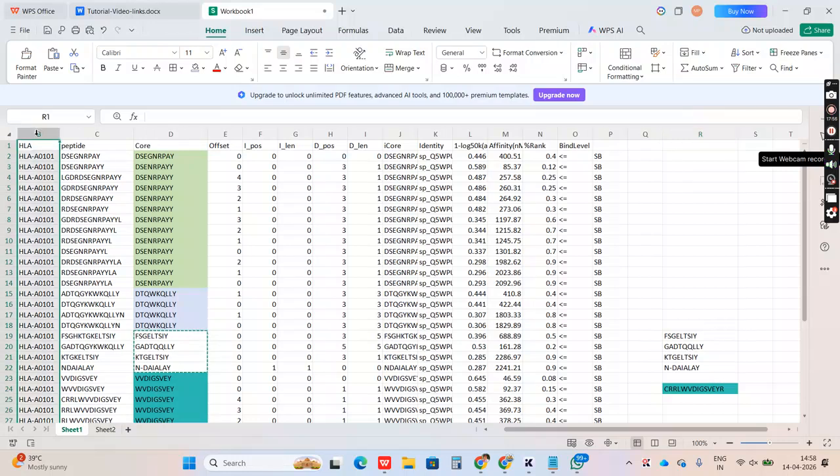Okay. So this HLA type is missing. So you are not going to publish this work anyway, so don't worry. We can ignore this HLA column for your project. Okay. But if you are doing real research, we have to consider this HLA column also. Okay. So there is nothing special about it.